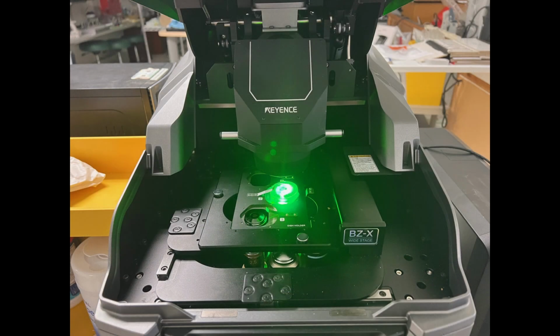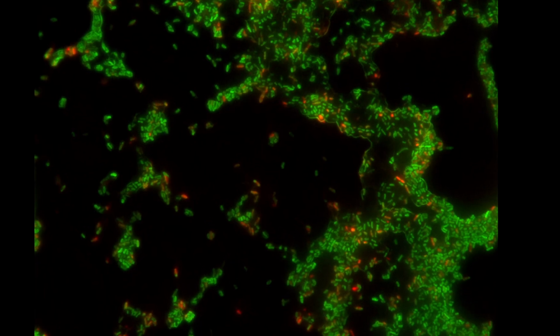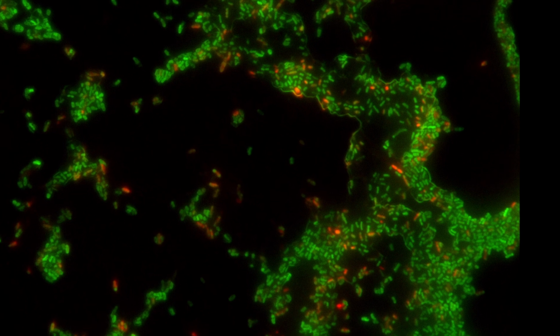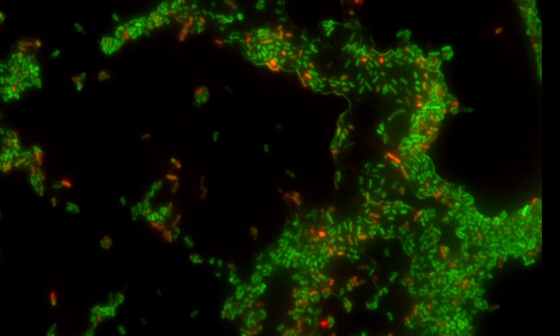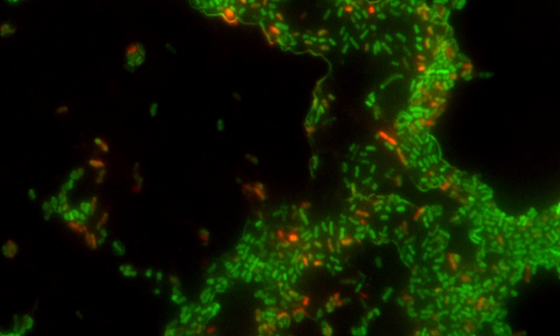So we've been doing a little bit of this using a live dead stain with oral microorganisms and getting some pretty good results with it. So these are wet cultures, live cultures, and the green is live bacteria and the red is dead bacteria.